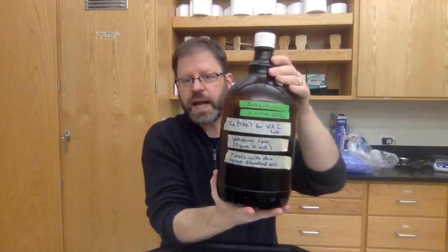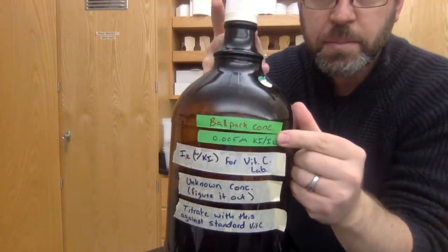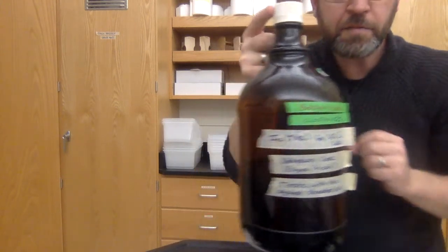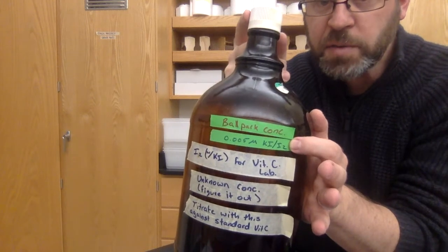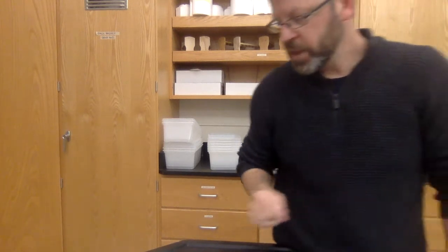Here's the titrant. I have lots of things labeled on this, but this is the most important thing right now. It says ballpark concentration 0.005 molar, KI I2, so potassium iodide and iodine, the Brinkmann. But it's only a ballpark concentration. This is really common, and so there's a world where I could figure this out and just tell you exactly what it is. But this is really common in real life that you would have to be really confident about your titrant. And so this is some of the pre-work that you would do.